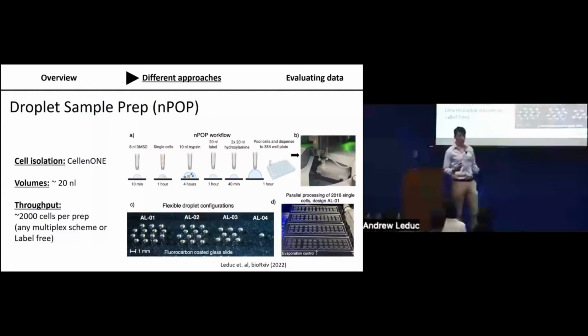One way to try and deconvolute these batch effects is by running the first sample picked up and then subsequently the last sample picked up, and seeing whether the variability from run to run is greater than the variability from position to position. That's one way of trying to assess it, because there are always going to be batch effects, but the question is to what extent, and how much does this impede you from making the biological inferences that you're interested in.